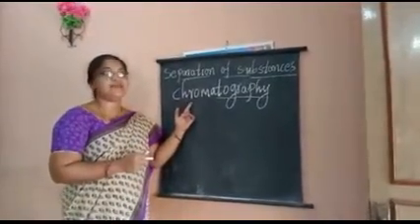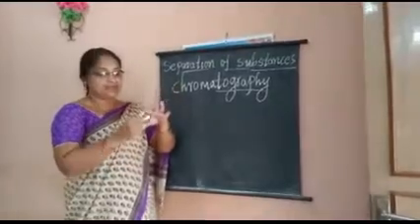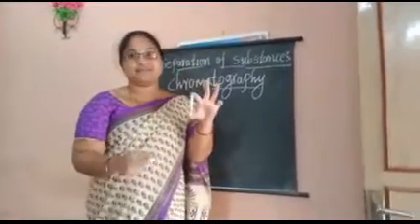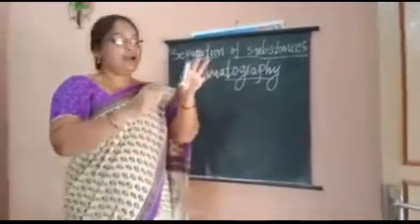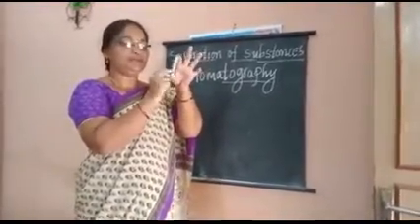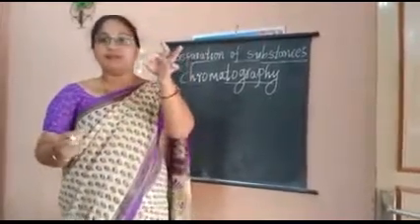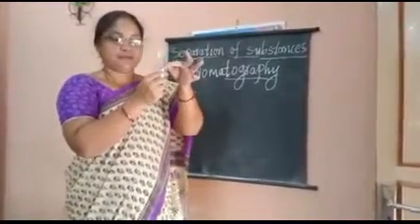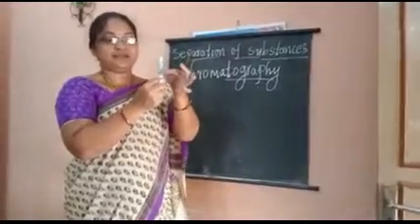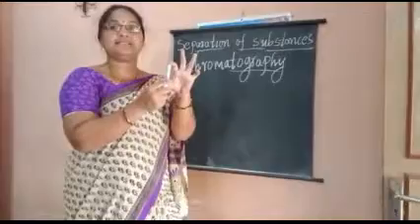It is a technique of separating mixtures by passing them through a medium. Here the chalk piece and water are the medium. The ink we are using is blue ink. I kept blue ink here. When I place this in water in a plate, we can see a mixture of colors, different colors separated. This method is chromatography.